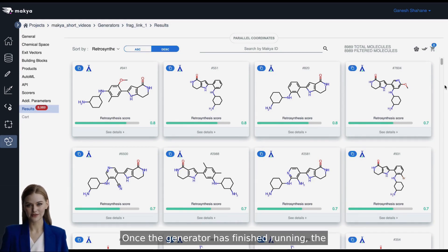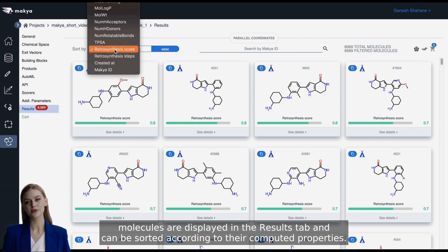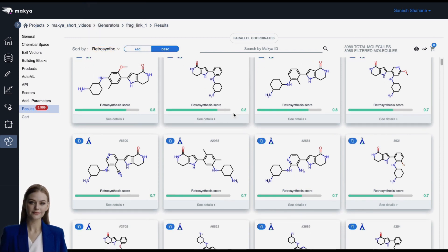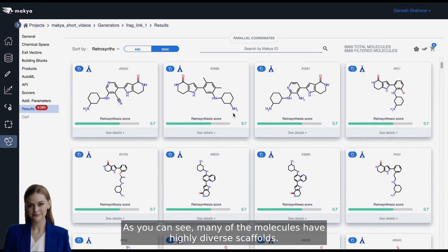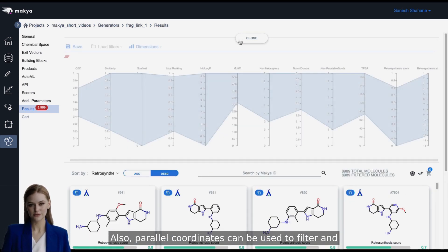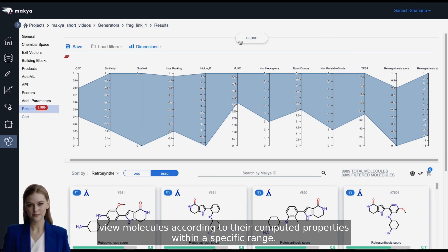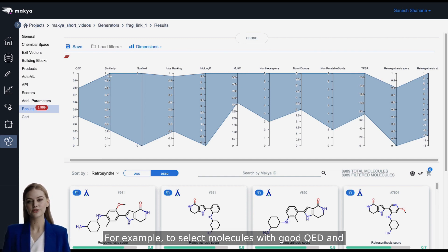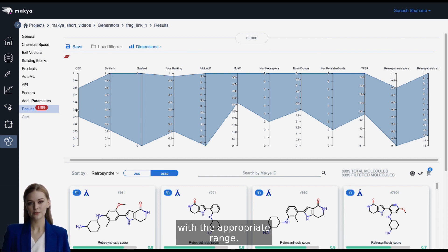Once the generator has finished running, the molecules are displayed in the Results tab and can be sorted according to their computed properties. As you can see, many of the molecules have highly diverse scaffolds. Parallel coordinates can be used to filter and view molecules according to their computed properties within a specific range. For example, to select molecules with good QED and synthetic feasibility, drag the cursor on their scales with the appropriate range.